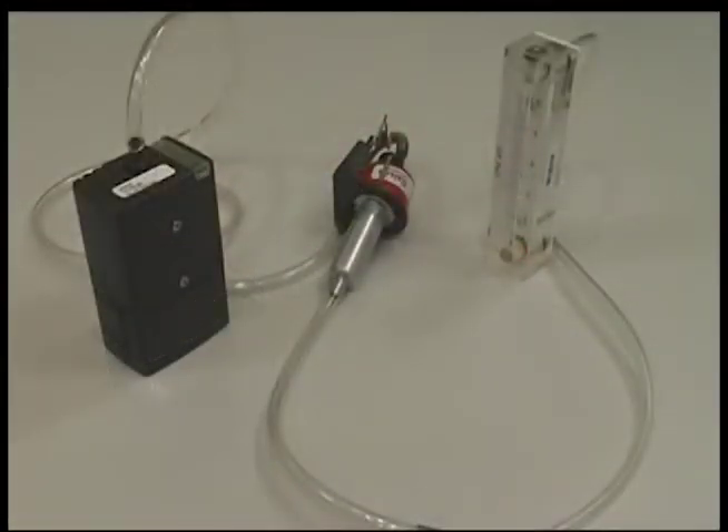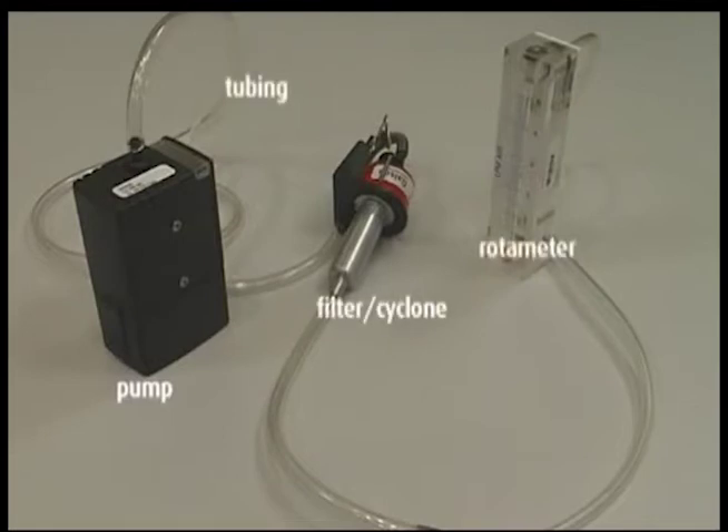The order of the components for calibration is: pump, tubing, filter cyclone with the calibration chamber in place, and rotometer.